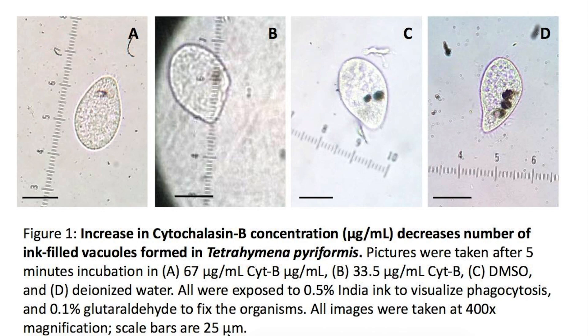Down here it says that scale bars are 25 micrometers in size. Then we could annotate nicely on our image with a line like this from here to here, and then we could take this and put it over to the scale. And we could see that it confirms that the diameter of Tetrahymena is about 50 micrometers.